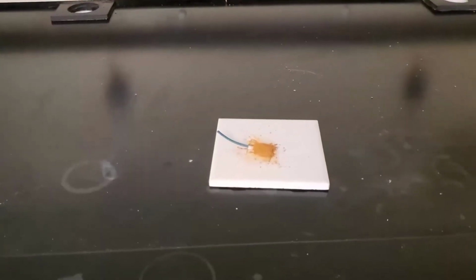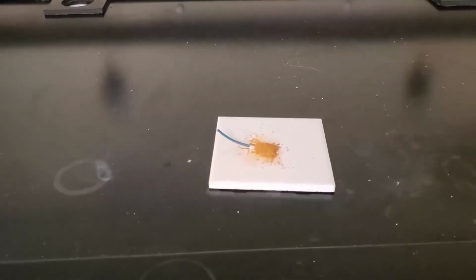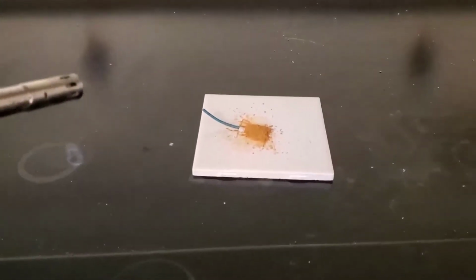So the first sign of a chemical reaction that I want to show you is that of a release of energy. Now, you can have an absorption of energy or a release of energy, but in real life it's much more common to see a release of energy. And what I'm going to do is I've made a mix of chemicals that is often used in fireworks because that obviously gives off a lot of energy. So let's look at these. All right, so here's one of my mixtures. Let's watch this and see if we get a release of energy.